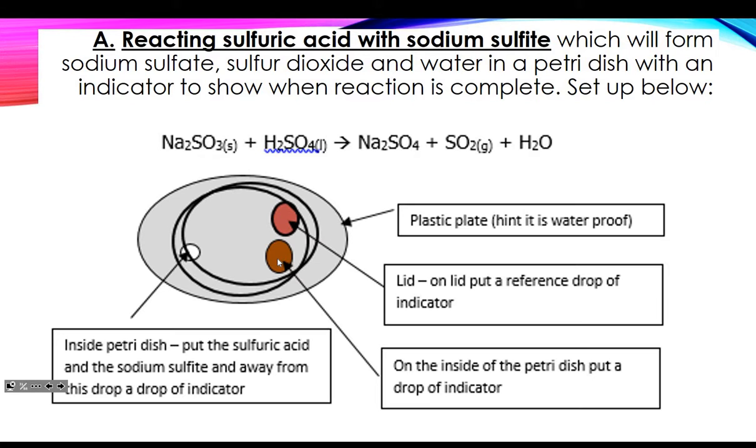This one, if you have contacts on, you have to be very careful with, because if the sulfur dioxide hits the liquid in your eyes and you have contacts on, it holds it against your eye and can burn it.